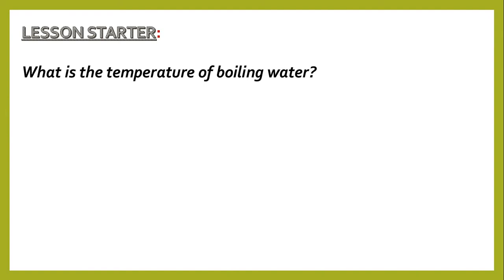Or what is the value of the temperature of boiling water? Okay, the answer is 100 degrees Celsius. If you're able to mention this one, you have done well.